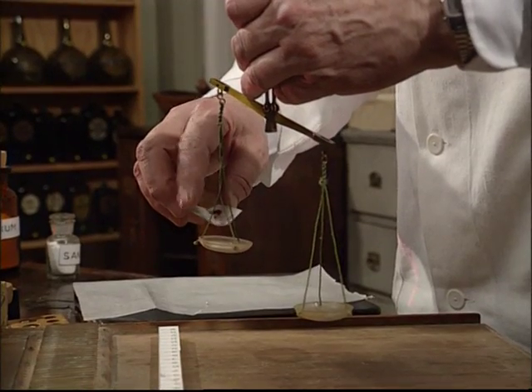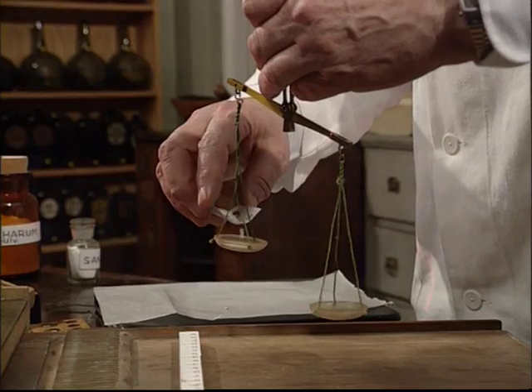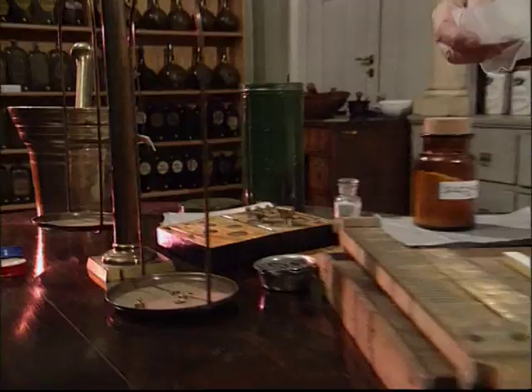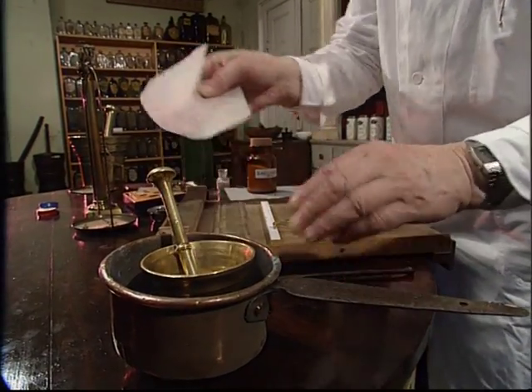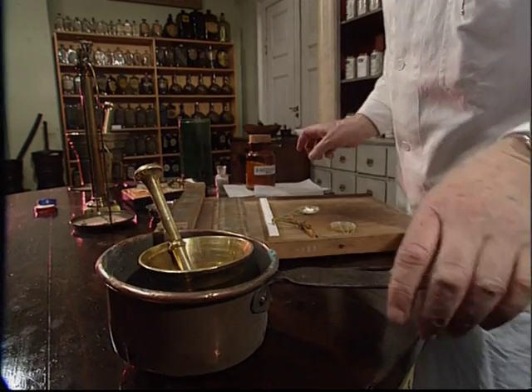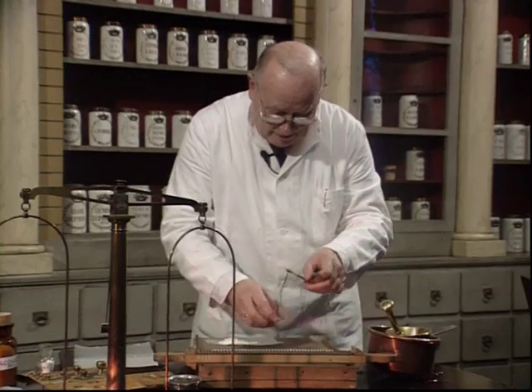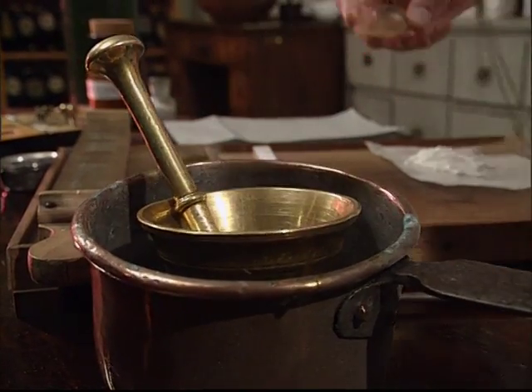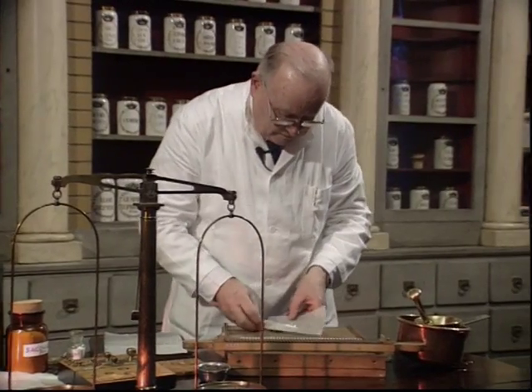A steady hand is needed to use a hand scale like this, something which Mr. Simonson has acquired after many years' practice. We put it into a mortar. It's immersed in warm water, and it can wait for us there a little while. We give it some santonin and sugar.